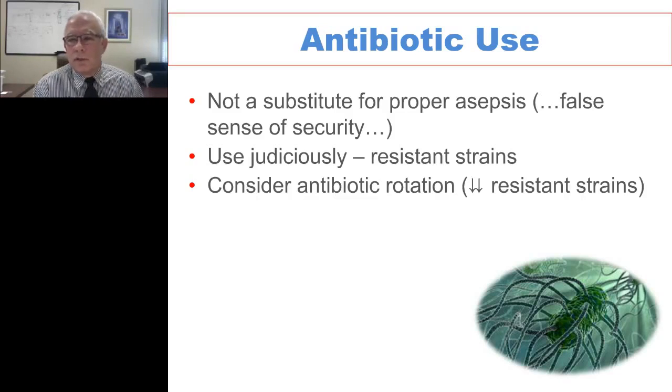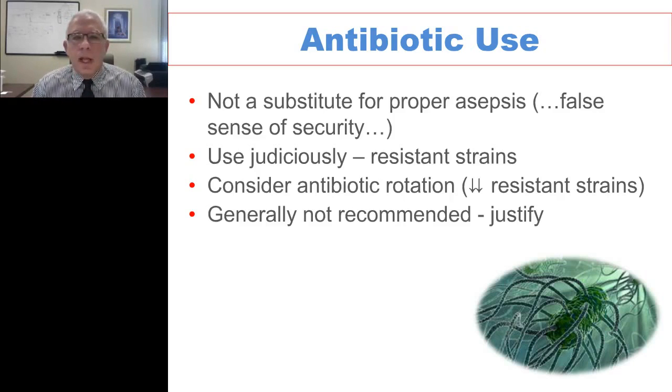Consider antibiotic rotation to minimize resistant strains. At a previous institution where I was, we used to rotate cefazolin with enrofloxacin each quarter just to minimize the whole issue of resistant strains. It's generally not recommended and should be justified in the protocols, because it should not be a substitute for proper aseptic technique. And in fact, I'll mention in just a second, it could really lead to variables. It's one more thing you're adding to your study.